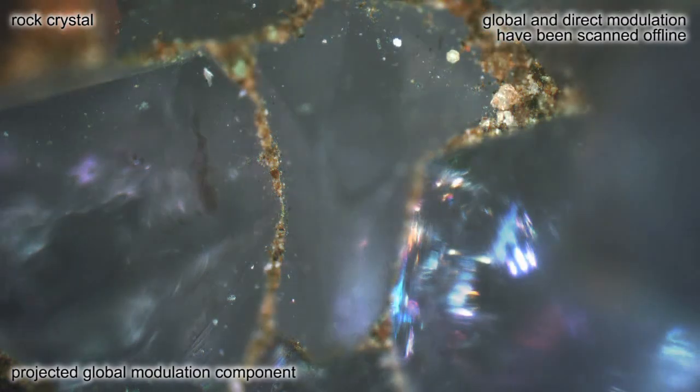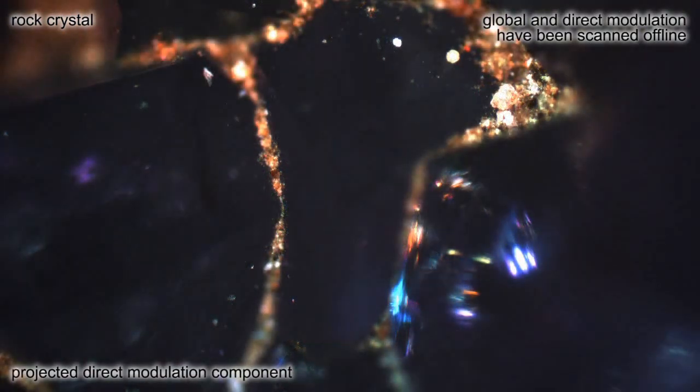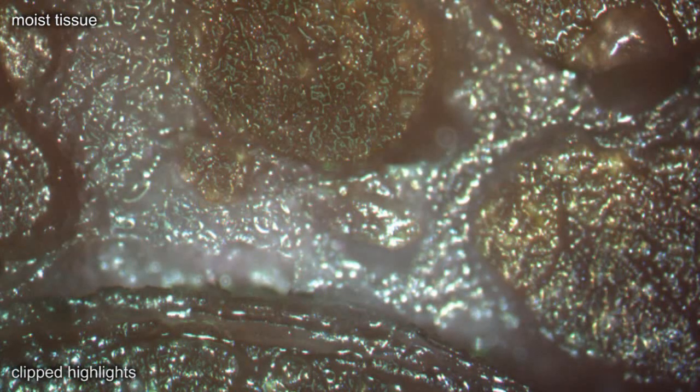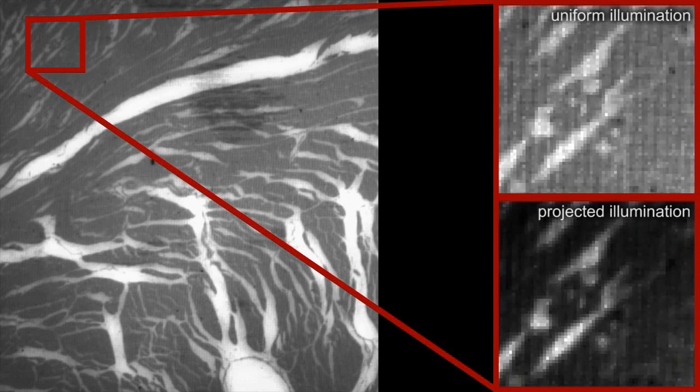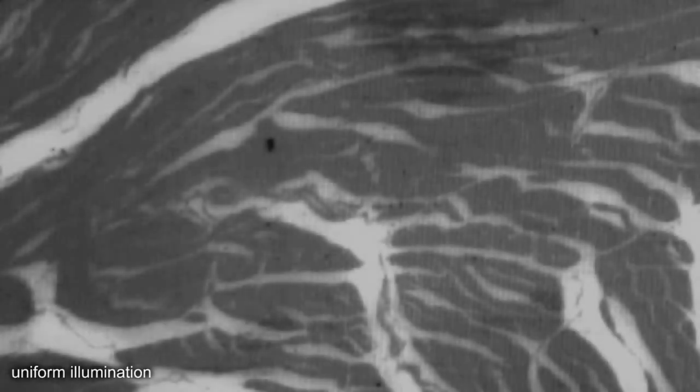While an improved visibility is beneficial for direct observations through the oculars, our techniques can also support digital microscopy applications. Reducing highlights or increasing the signal-to-noise ratio through an optical contrast enhancement can advance image analysis techniques, such as automatic thresholding, as shown in this example.